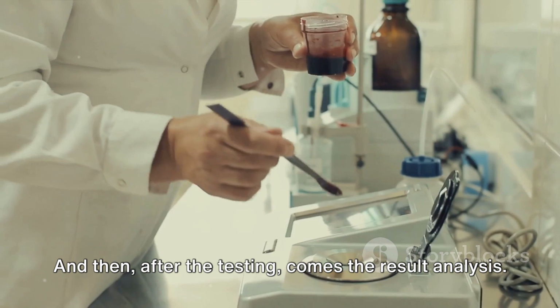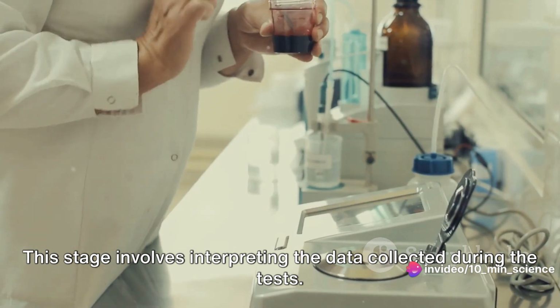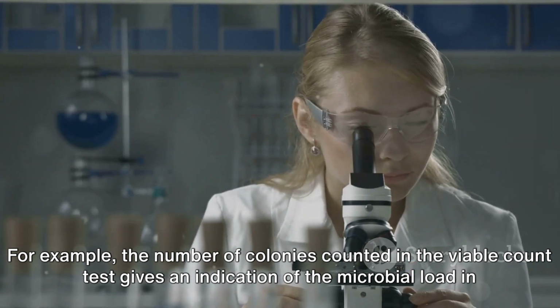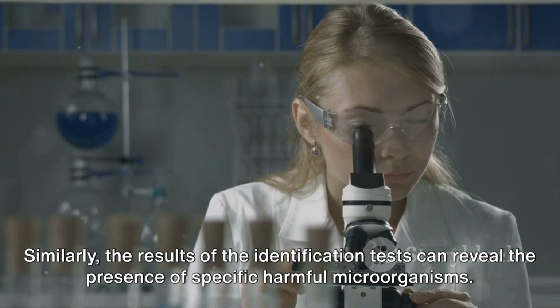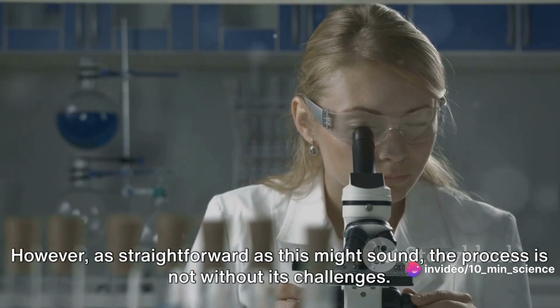And then, after the testing, comes the result analysis. This stage involves interpreting the data collected during the tests. For example, the number of colonies counted in the viable count test gives an indication of the microbial load in the sample. Similarly, the results of the identification tests can reveal the presence of specific harmful microorganisms.